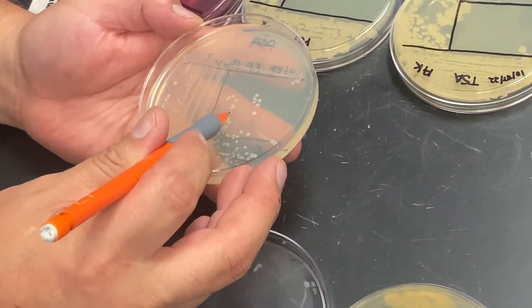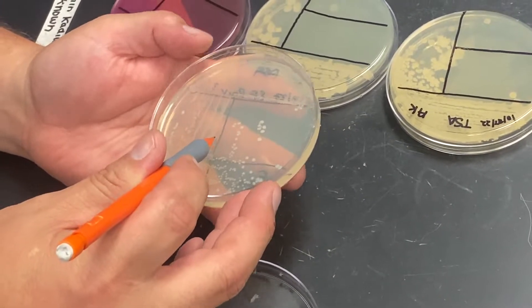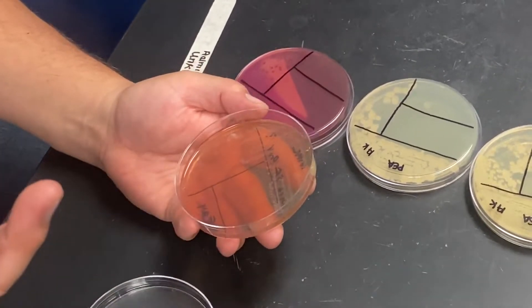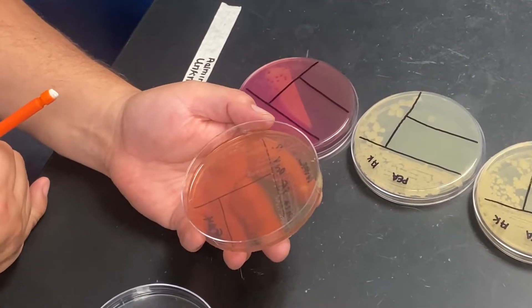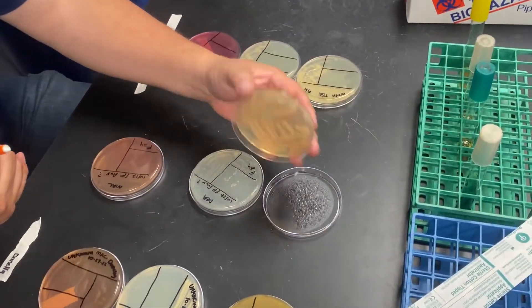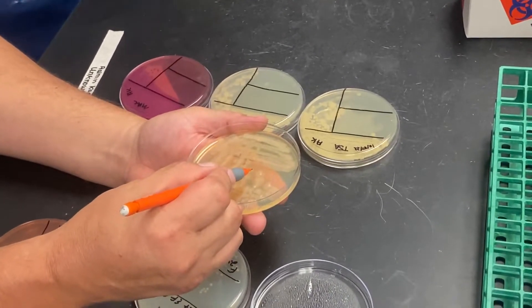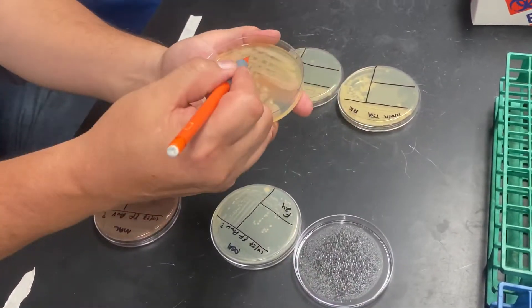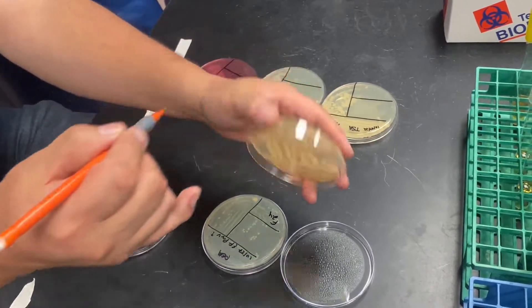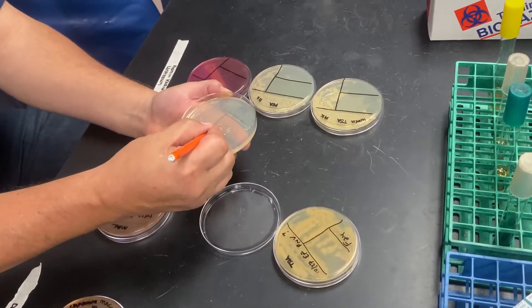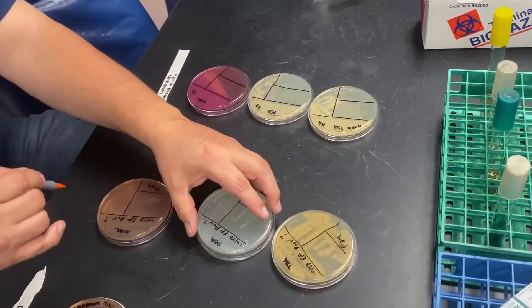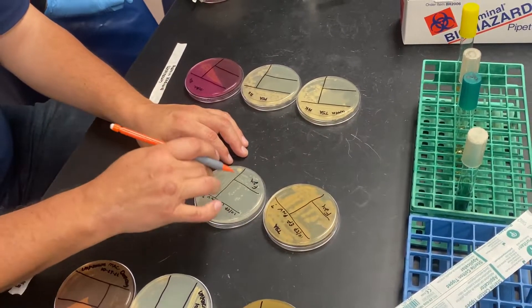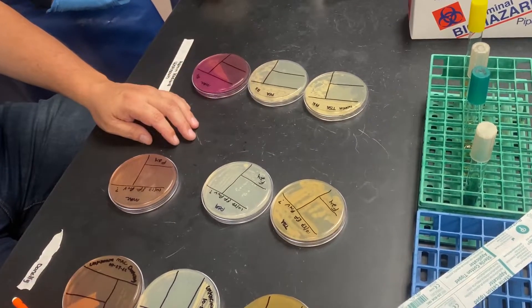The little, kind of the grayish looking ones, the little whitish looking ones are growing here. And if we look at the colonies on McConkie, they look kind of medium sized and they're umbinate. Umbinate means there's a raised center, kind of like a nipple. So if you go back to the TSA plate and look at these, you'll notice that the pinkish colony is also umbinate. So which one do you think is the gram negative? The fruity looking dude that's pinkish orange and umbinate or the little whitish guy that's smaller? So this gram negative is that big old gigantic colony that's umbinate. Therefore, this has to be your gram-positive. See how it's done?